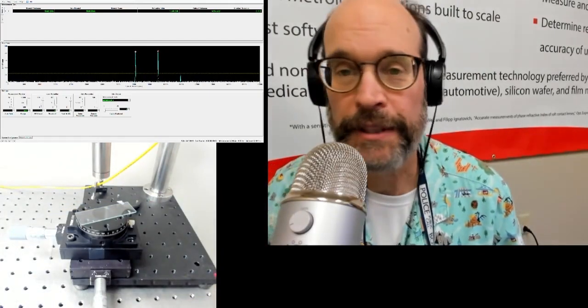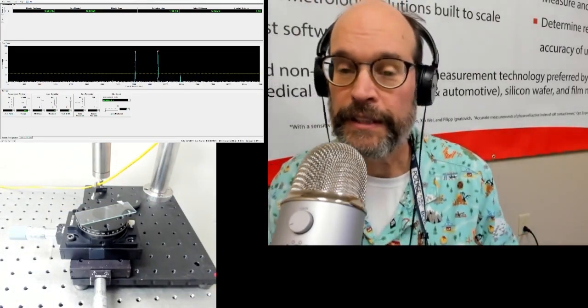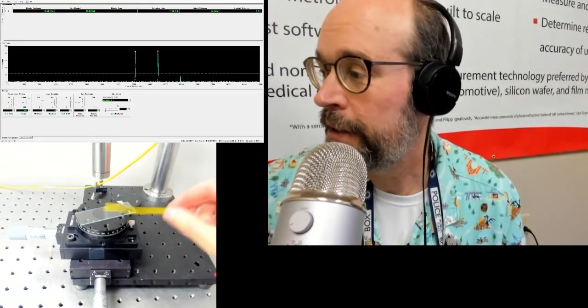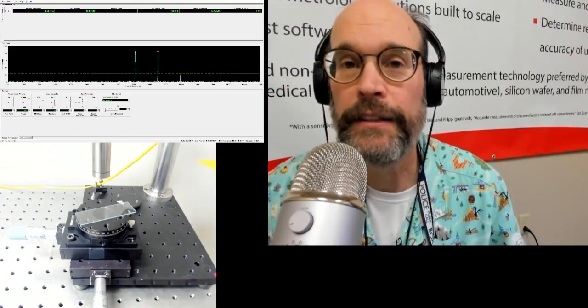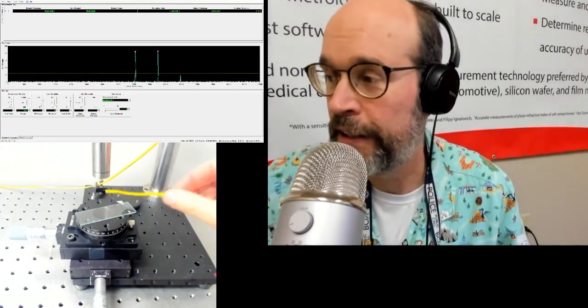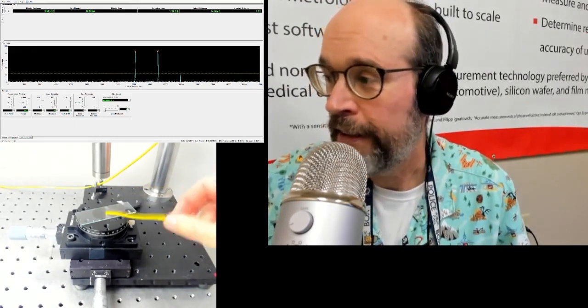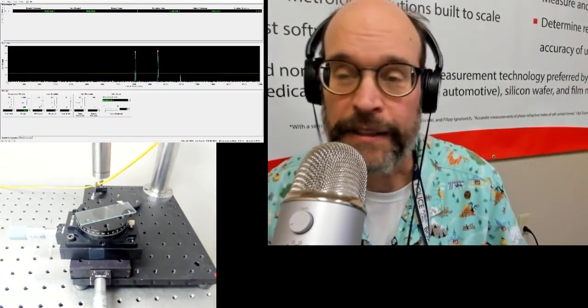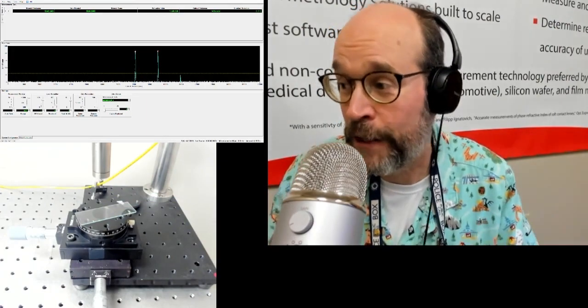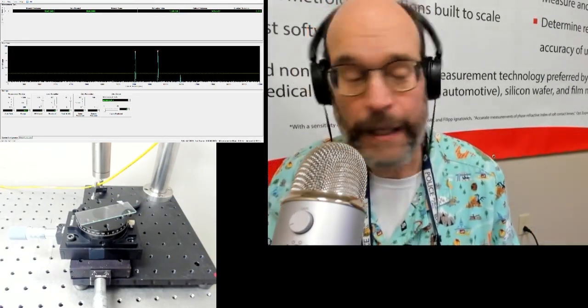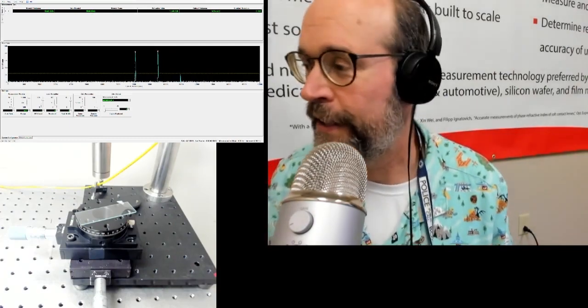This probe helps us confirm that we know the exact measurement to within plus or minus one micron of this slide. And I forget something like the universe ends or whatever if it's not exactly right. But nevertheless, we have a method of confirming this thickness.